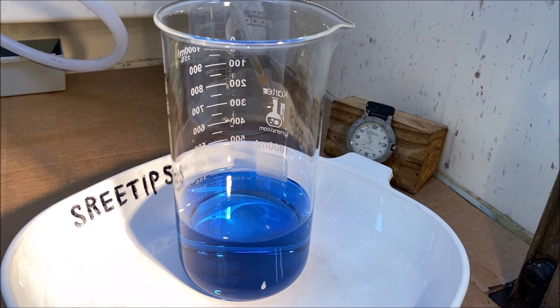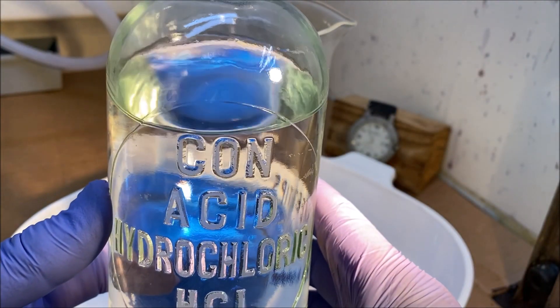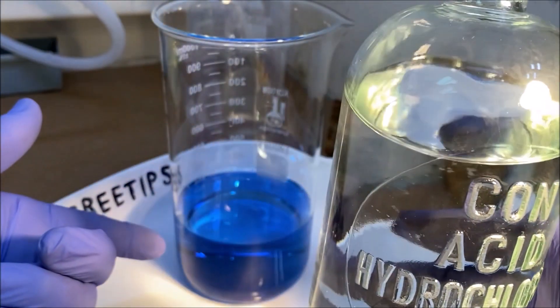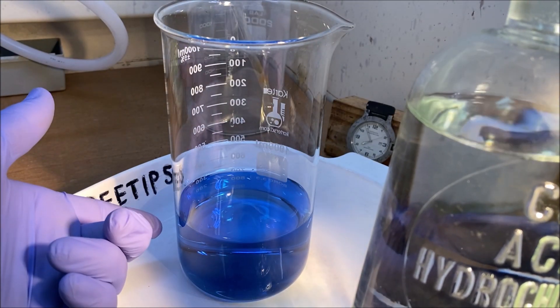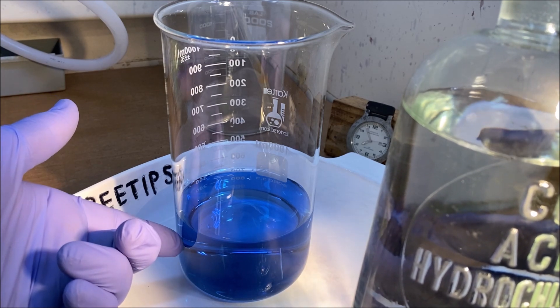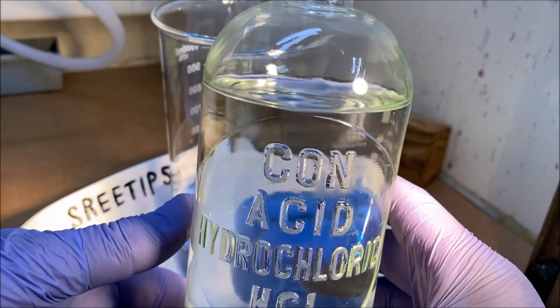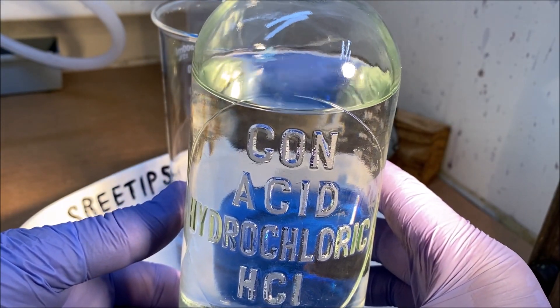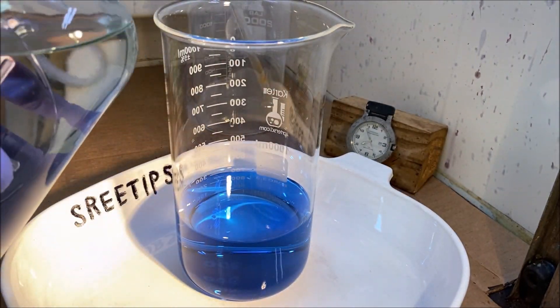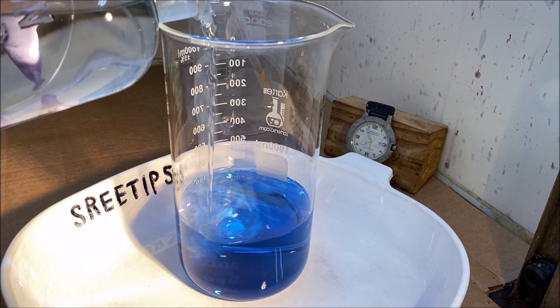Now for a most excellent reaction, I'm going to re-acidify this solution. Remember, we've got the ammonia-soluble palladium precipitate dissolved in this ammonia. The blue is copper, so we had some copper contamination. But now we're going to re-acidify this with some hydrochloric acid and get our palladium salt out of this beaker. Here we go.